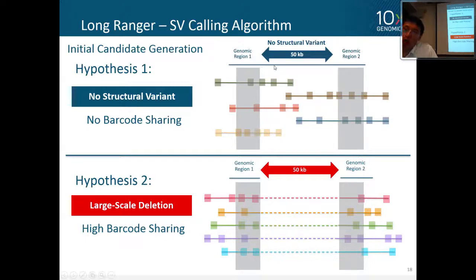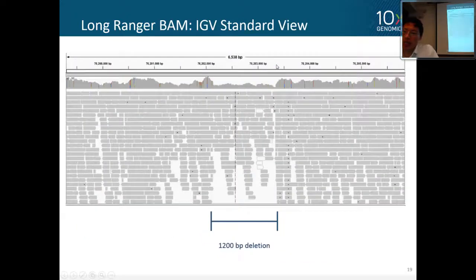So let me show you one of the results they showed us. This is what you get using a regular approach to DNA sequencing, and here is your read map. You can see there is some up and down, meaning the coverage, and the colorful ones are normally where a SNP occurred in those regions.